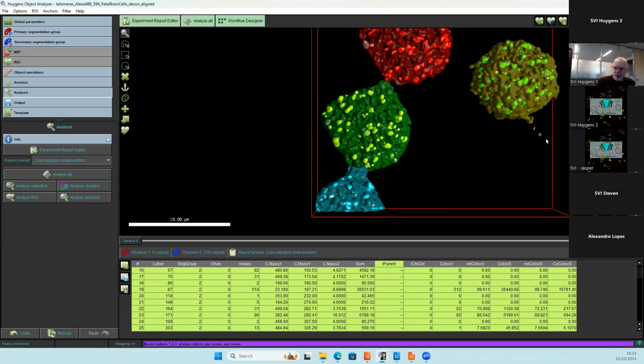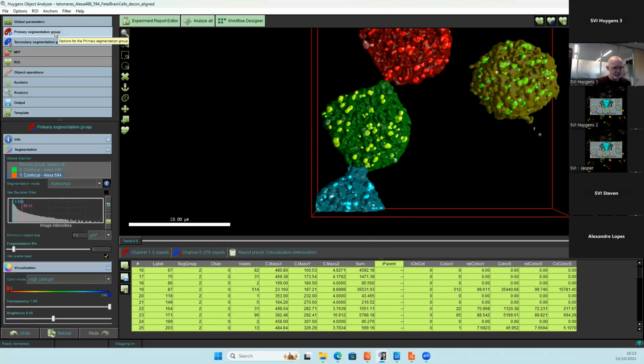There are 2 objects here, just below this right cluster, that are also gray. And you see clearly that the nucleus is not extending towards these 2 objects. We could change segmentation of the nuclei by, for example, lowering the threshold and trying to include these objects as well. And I know that will work, but again, we skip this for now and we go to a different option. And the different option, that's session number C, demo cluster analysis.